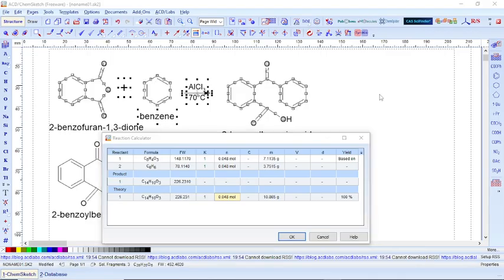Now, we have one pending problem. Let me ask the question now. Do you think with this we can jump to the lab? No. I want to ask a question.